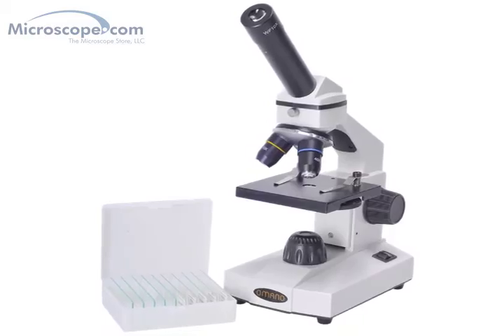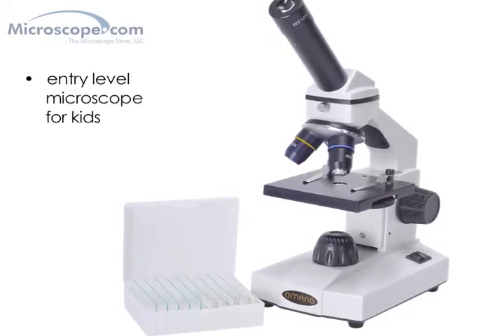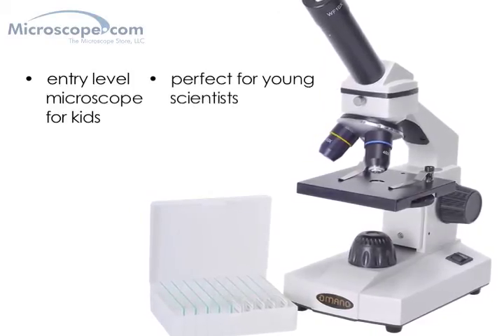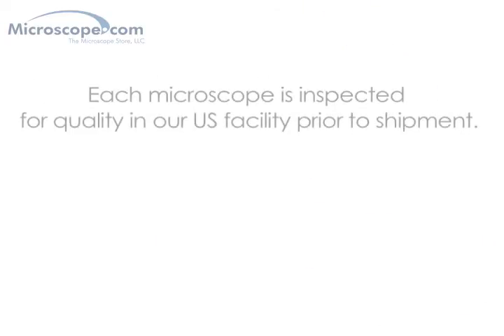In summary, the Omano 116L is a very decent entry-level microscope for basic use in a home or school setting. It will allow your child or student to explore the hidden world of microscopy for an extremely modest investment, and will hopefully spark an interest in science that will be lifelong.